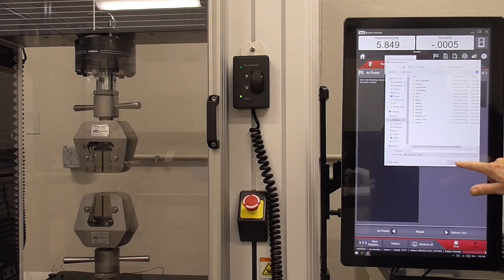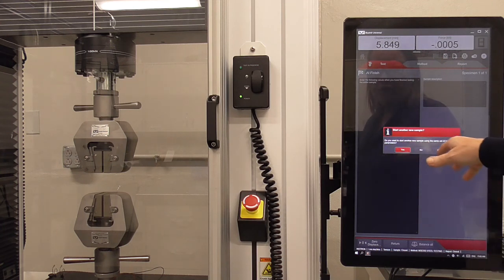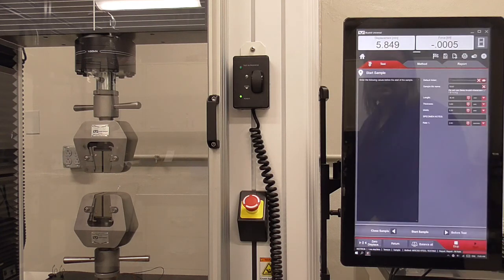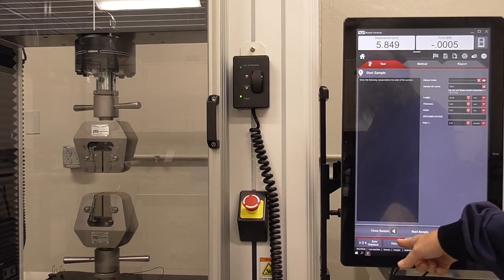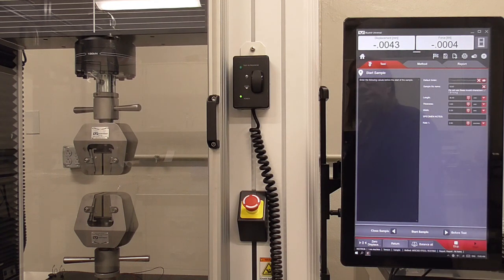Now it's asking if you want to test another sample. If yes, hit yes and it'll go into another test. The grips did not return automatically, so hit the return button and the displacement should go back to zero as they move back together. Sometimes the machine does this automatically — that's why you want to get the dog bone out before hitting finish, so the grips don't crash the broken pieces together. Now we're ready to test the second sample.